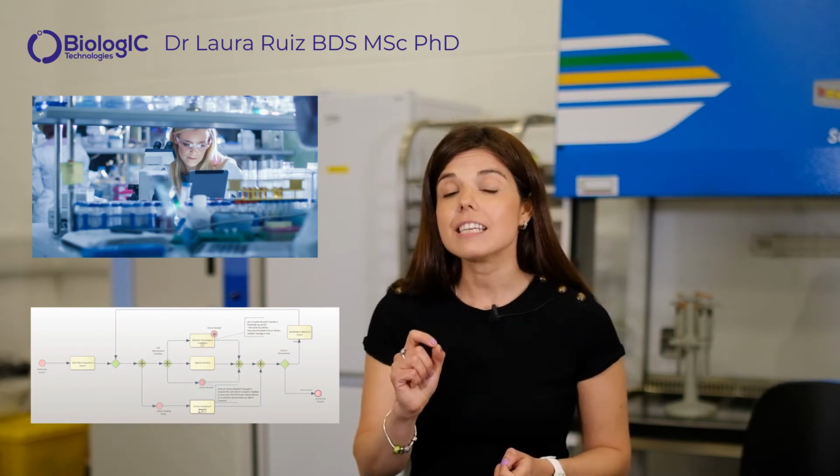So how does a TDK partnership work? We first map your process by translating your human-operated protocols into what the biology experiences during the process. This is the first fundamental step for codifying the biology of your process and being able to program it. What is the benefit of doing this? You get reproducibility and ability to scale without changing your manufacturing technology in your next steps.